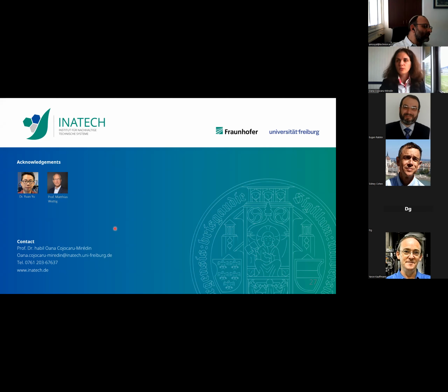Yes, so you are right. When you do correlative microscopy, ideally, for example for the TEM, I also did that in the past, and in my lab we have developed with a Japanese company, Hatam, a holder which can go in the TEM and the atom probe. Of course, you have such tiny tips, and if you want to transport these tiny tips from one holder of the atom probe to the other holder of the TEM, you can destroy them. To make it really user-friendly, much faster, and to increase the yield, we have such possibilities.